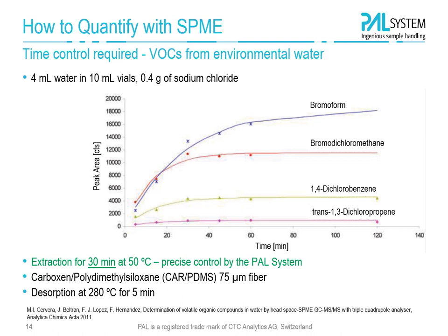After 30 minutes, there is already a good sensitivity reached. Longer extraction times would not improve the response very much. In particular, you see this for the 2 compounds of the lower intensity.